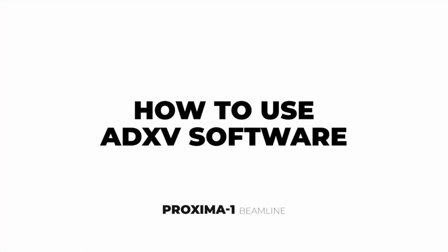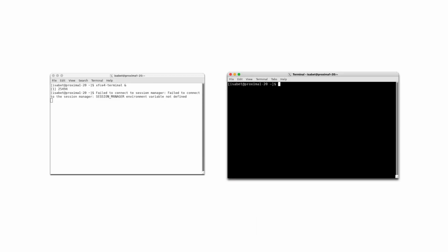This video will show you how to look at diffraction images in the ADXV software on PROXIMA-1 Beamline. To start ADXV, you have to type the ADXV run command in an XFCE4 terminal.